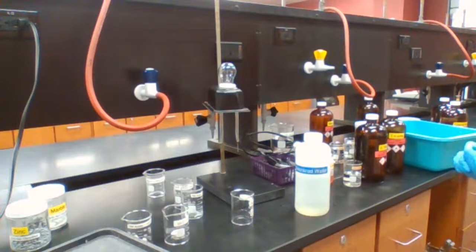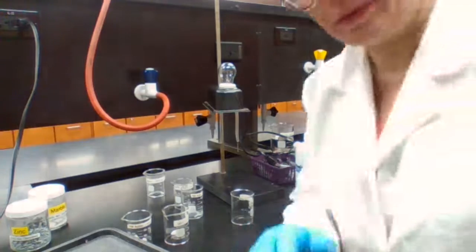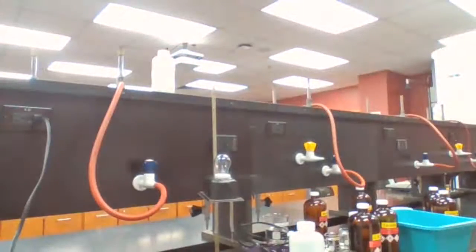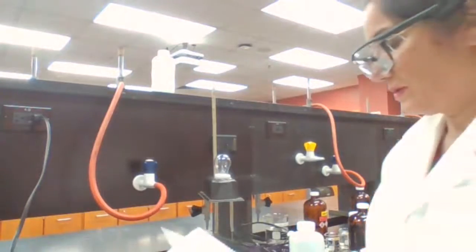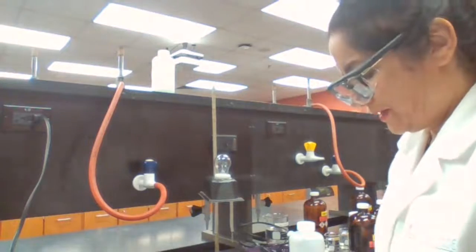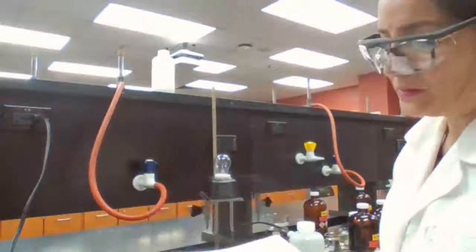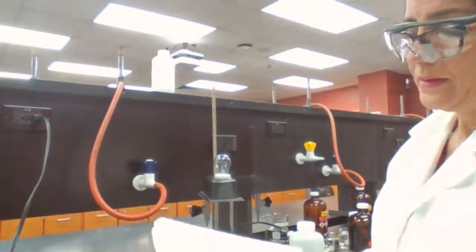Okay, I don't have the 6 molar HCl here. I just requested it, we will get it soon. In the meantime, I'm going to see if I can do the second part of the experiment.